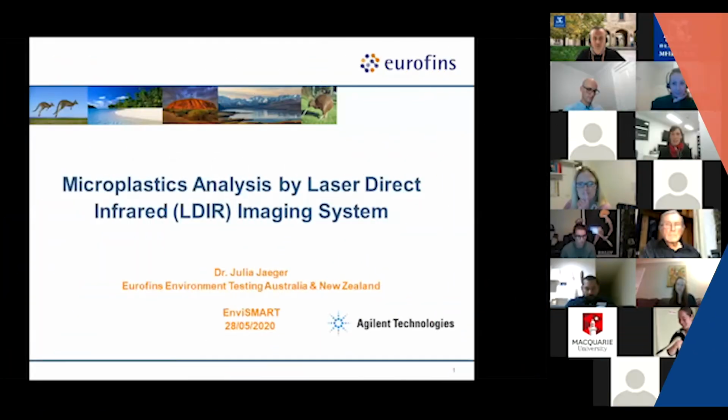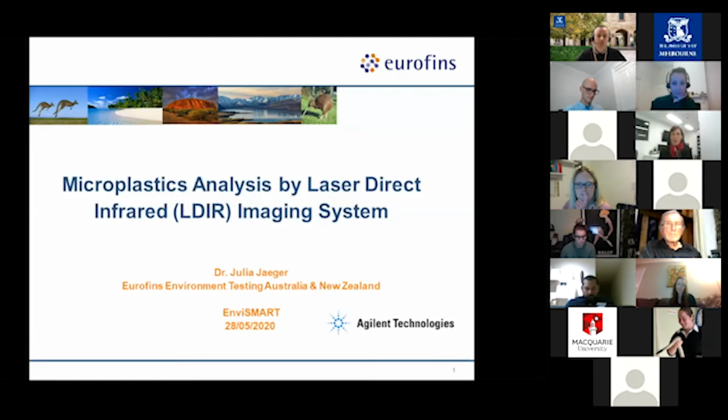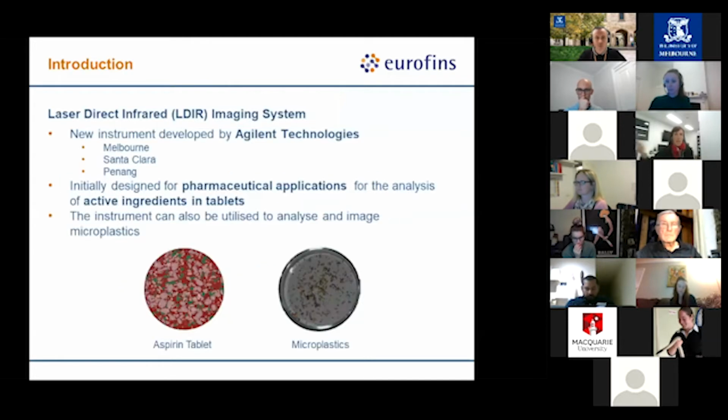And today I want to present also on the topic of microplastic, but more the analysis side, also mostly waters is what we're currently focusing on. There's lots of different methodologies, and I just want to present today or give you a brief overview of the Laser Direct Infrared imaging system as a method to analyze microplastics.